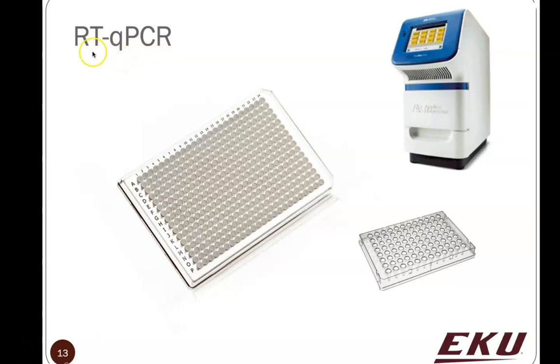But we usually call it, for the most part, reverse transcriptase quantitative PCR, and it's quantitative in the sense that it can tell us how much virus or how much RNA was in our starting solution with respect to what was on that swab that got extracted. So we'll talk about that a little bit here in a minute.